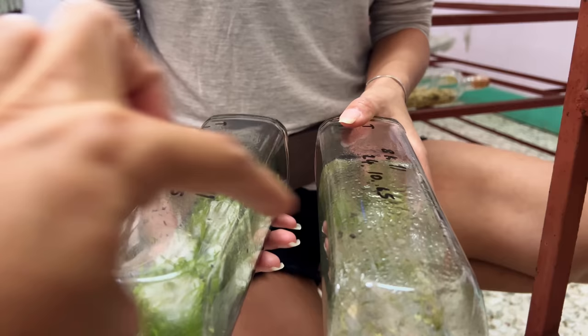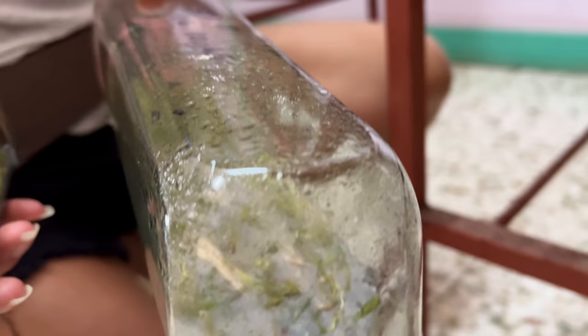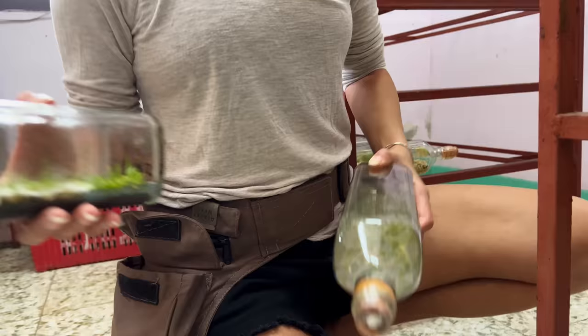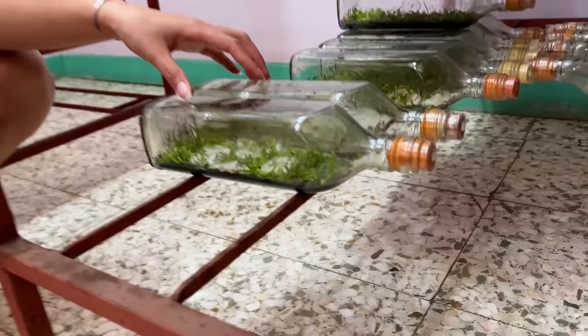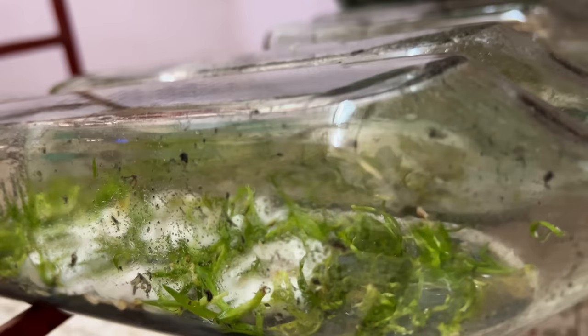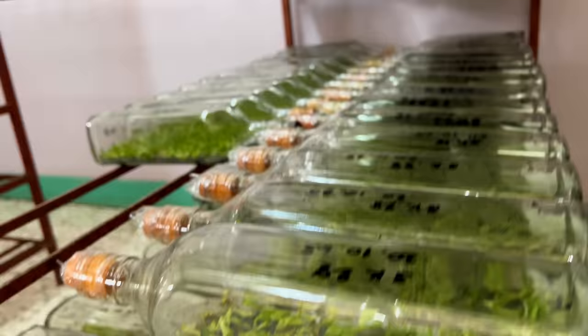I can't tell you whether this white one is because you didn't wash your hands, or this one is because you didn't clean the equipment — it's really hard to tell. But we need to keep track, write it down — how many percentage went bad. And once it's contaminated, there's nothing you can do.